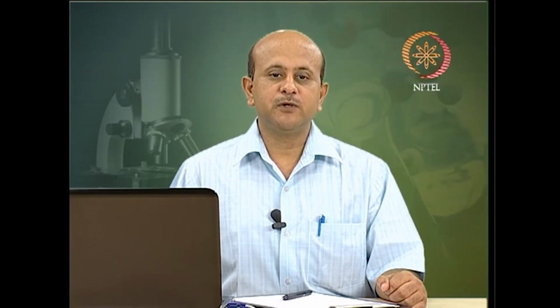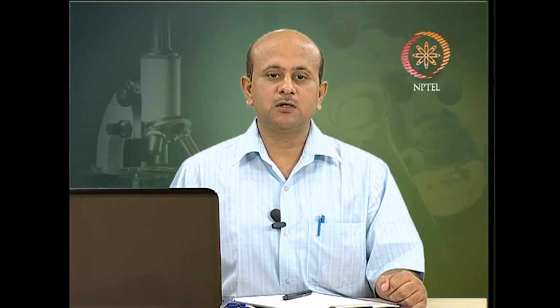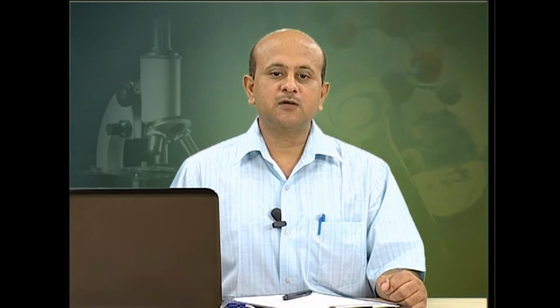Dichroism is a word which is derived from Greek, which means two colors, because the sample under analysis has one color if illuminated with the right polarized light and a different color if illuminated with the left one. So, the color in fact depends on the light absorption here.